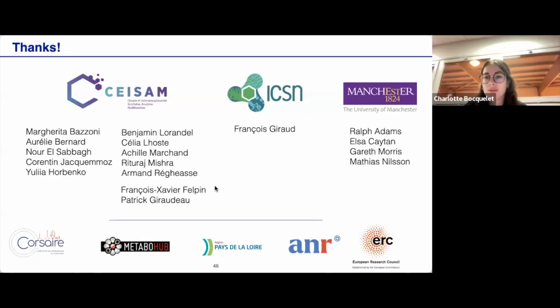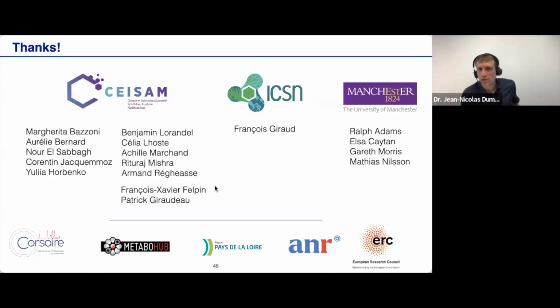Thank you. I will end with this last question, but I think you already answered it partially. Can we integrate a static reference in the cell for quantification? So I think one can. It's not something we're doing in Nantes, but there are a number of examples in the literature. I think of the Toronto group of Andre Simpson using an internal cell for the lock signal, and maybe they also have a reference in there already. But one could do that.